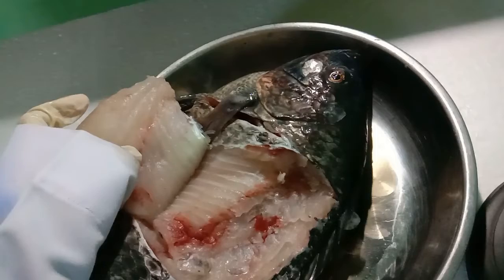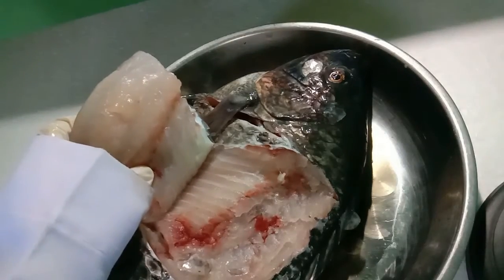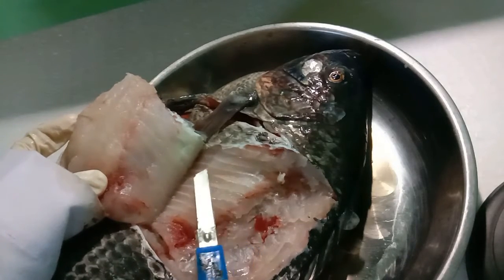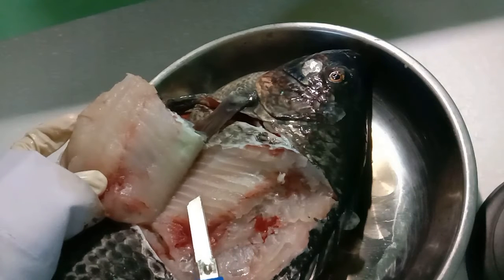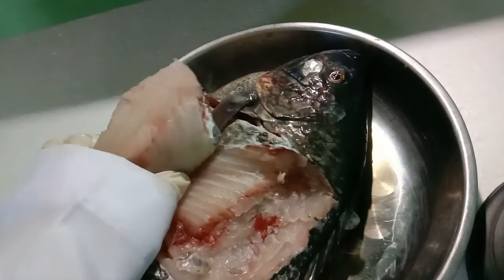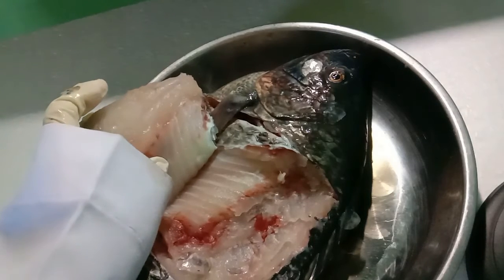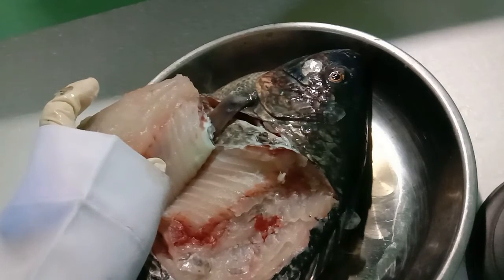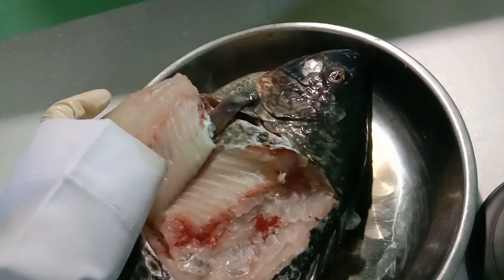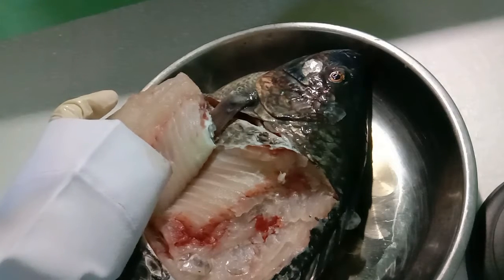Next is myomere and myotomes. Myomere is this line. You can see the white line in this fish. Myomeres are the blocks of skeletal muscle tissue. They are commonly zigzag, like V or W shaped muscle fibers. The function of the myomere muscle is to bend the body from side to side to provide locomotor force.